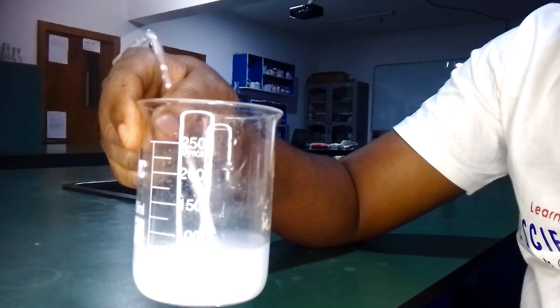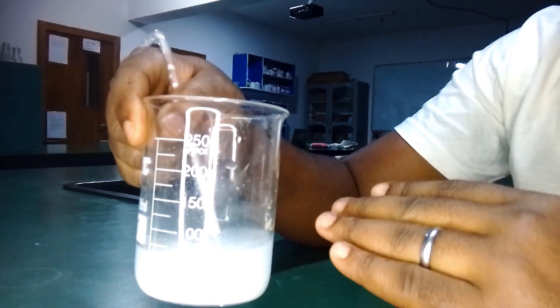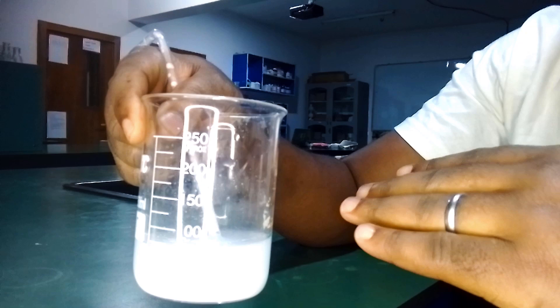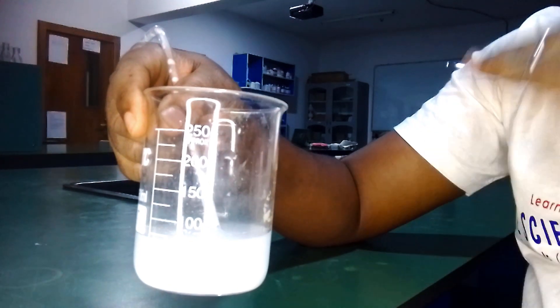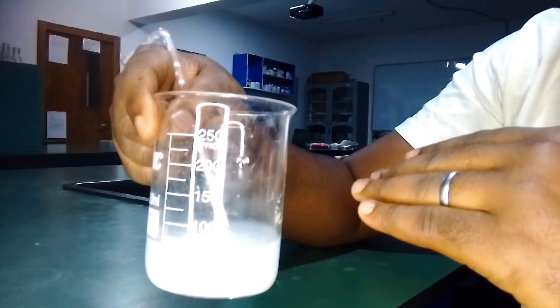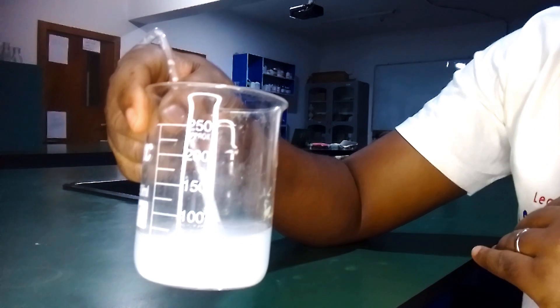This is a very simple test for carbon dioxide. Now, if you continue passing carbon dioxide into this suspension — because it is now a suspension since it contains insoluble calcium carbonate in water — at that point the milkiness will disappear. But because of time, we're not going to do that here; you can try that in your own lab.